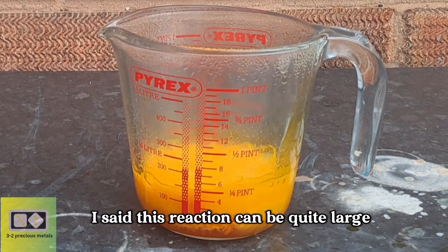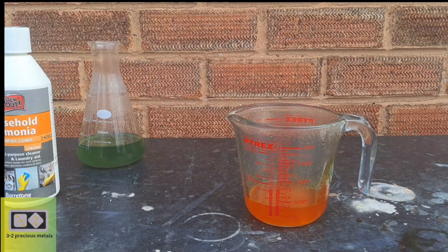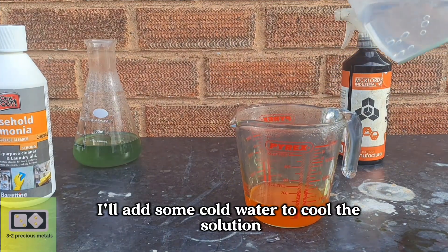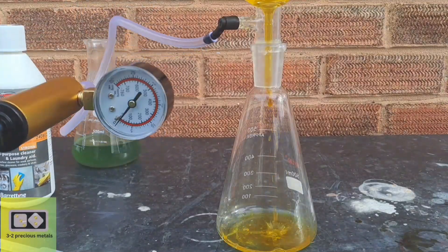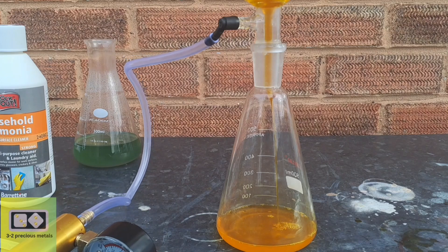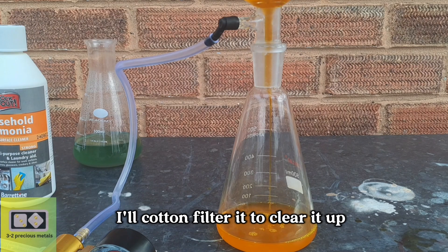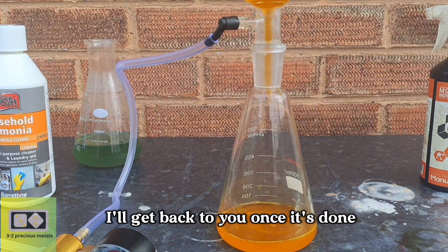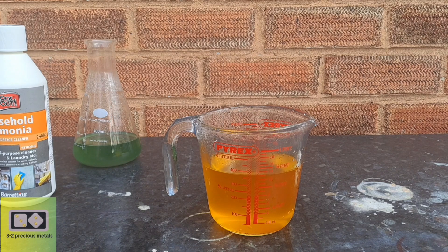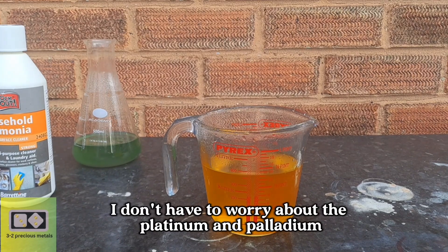Remember earlier I said this reaction can be quite large — this is why it's best to use a larger beaker. I'll add some cold water to cool the solution and then I'll begin the filtration. I've noticed that the solution had a light cloudy appearance, so I've decided that once it's pulled through this filter, I'll cotton filter it to clear it up. For this second precipitation, I'm using sodium metabisulfite. This produces less waste than the ferrous sulfate, and this time I don't have to worry about the platinum and palladium.